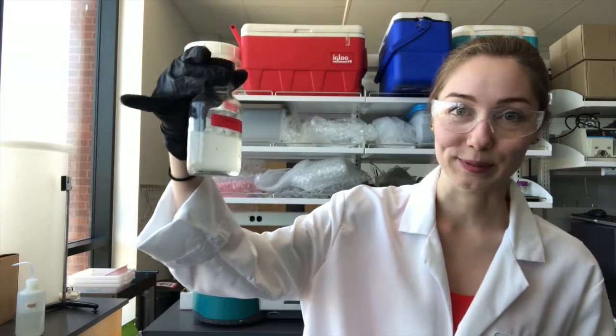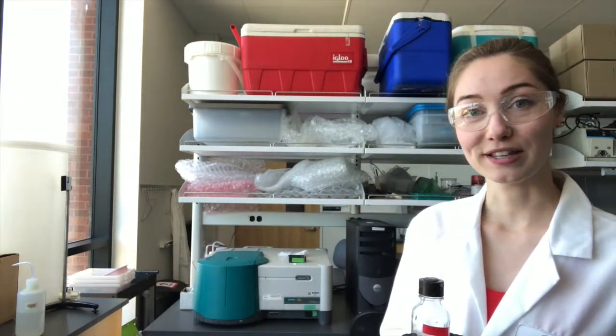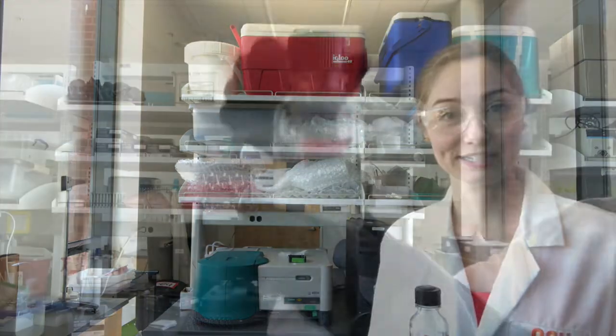This is something I've been developing to monitor biological experiments where I'm trying to degrade PAHs with bacteria. I have an example batch bottle here that I'm going to be taking a sample from today and analyzing with this fluorescent spectrophotometer that you see behind me.